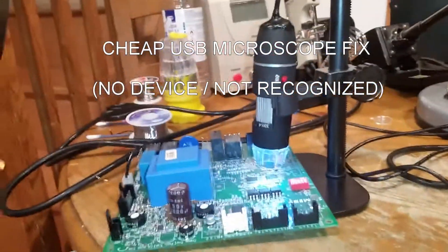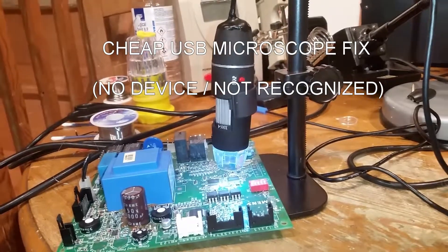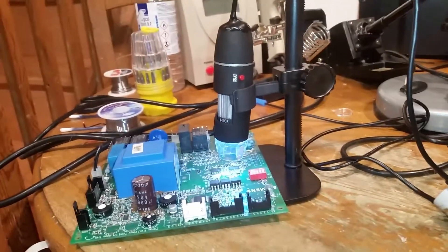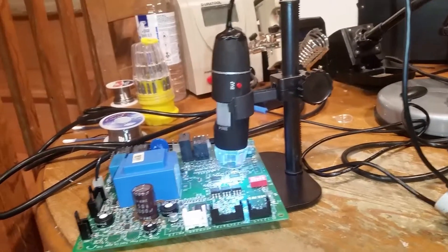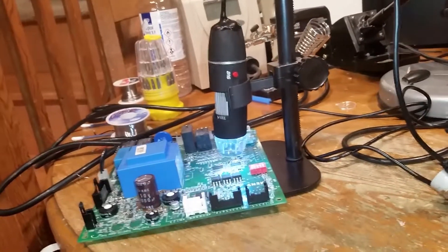It's another little YouTube fix-it video. This is a USB microscope. These things are all over eBay. I paid about 13 quid shipped all the way from China for this one and it's a great little tool. I had it running for about two hours and then it packed up. I've got an Andon Star as well, but to be honest this is for 13 quid pretty good.